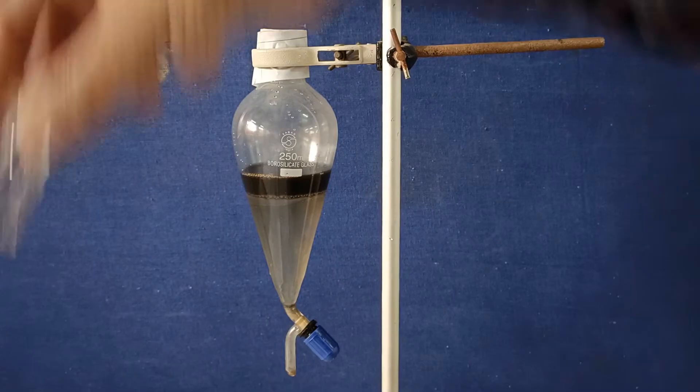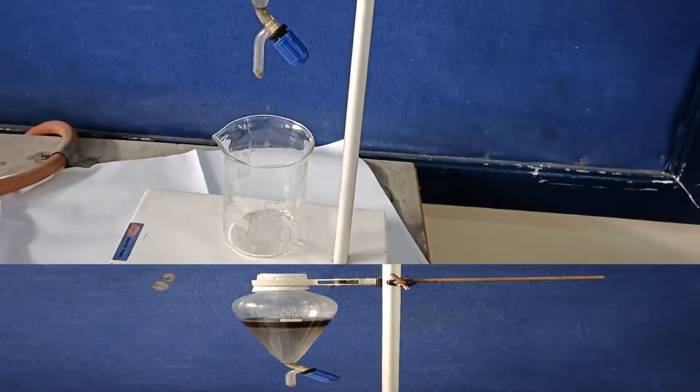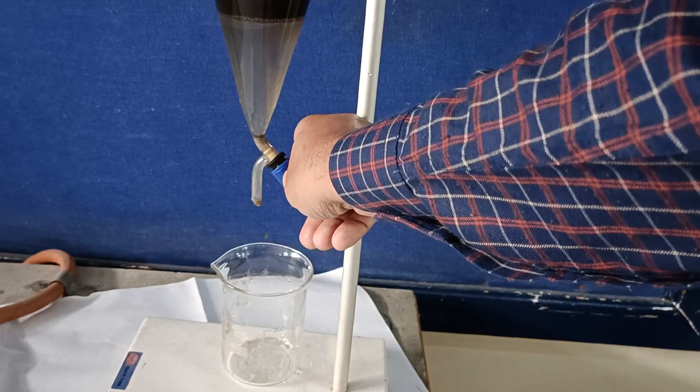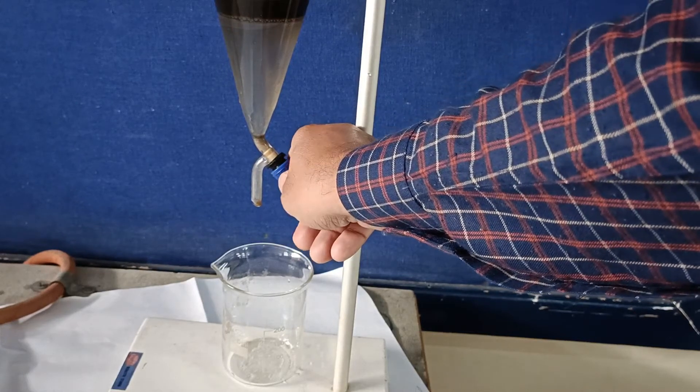Open the knob of the separating funnel. Opening the stopcock, the denser liquid comes out from the bottom part of the separating funnel into the beaker.